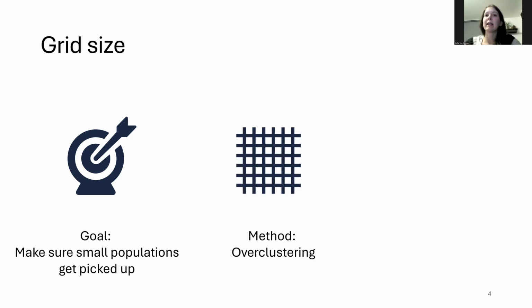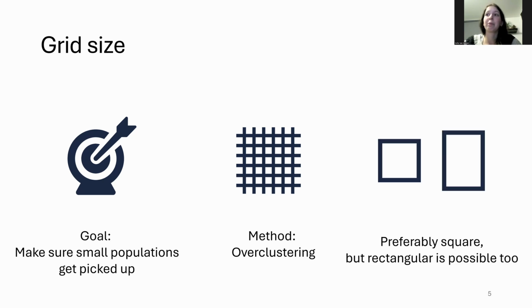However, as a guideline, it's always good to try to overcluster. At this point, we're not trying to have one cluster per biologically meaningful population, but rather just to have as many clusters to make sure that each of them are still pure.